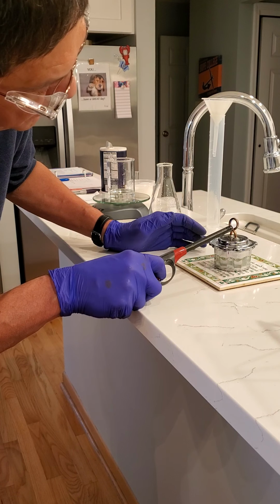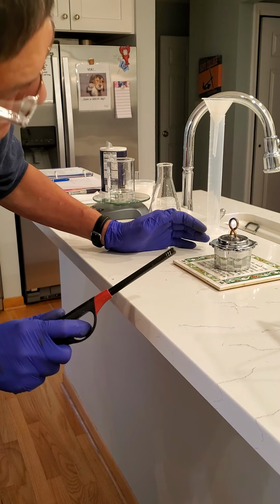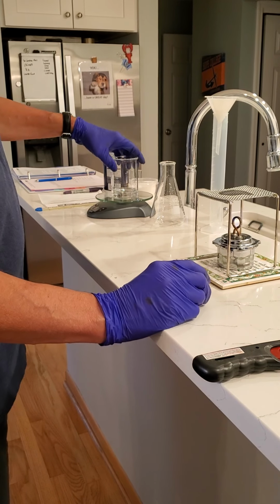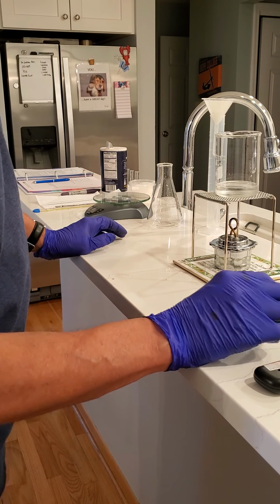And then we're just going to heat the beaker gently. You don't want to heat it too quickly, because otherwise it'll boil over and bump. So we got that going nicely now, and we're going to add our beaker on top, and we're just going to heat it gently until all the water has evaporated and boiled off.